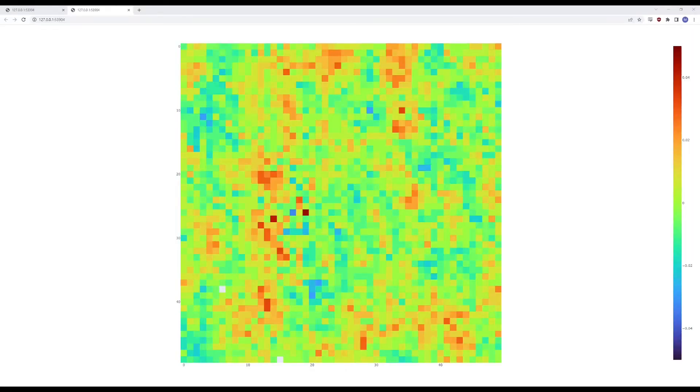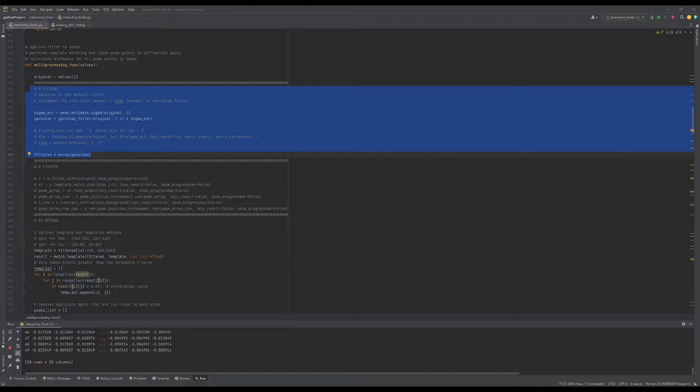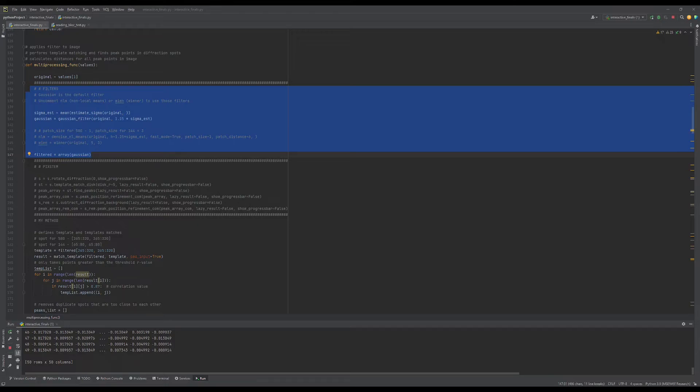An interactive heat map will open to view in a browser tab. In the code, the default filtering method used is a Gaussian filter, but the user can adjust the filtering method by uncommenting the specified lines of code in the multiprocessing function and adjusting the variables, or adding their own filtering method.